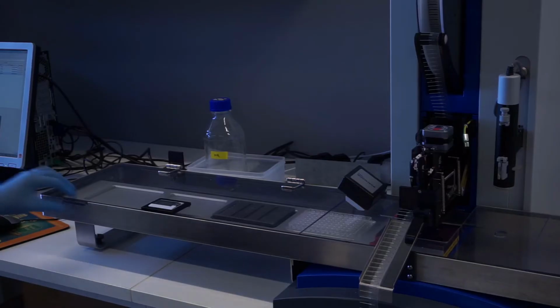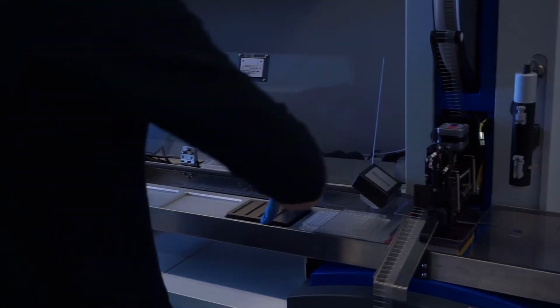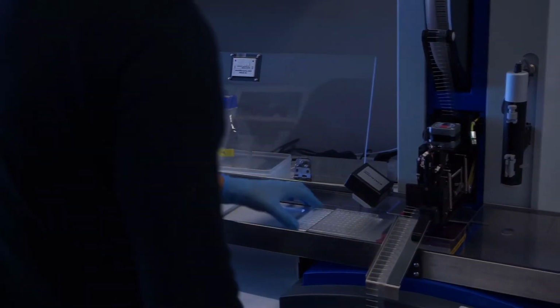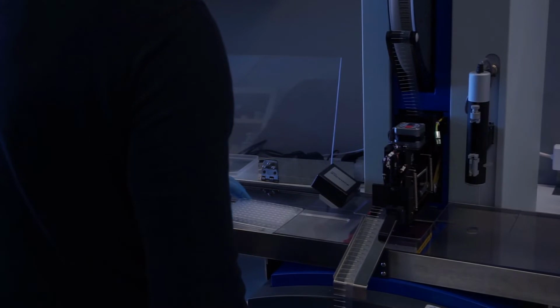When the run is finished, take the plate out and seal it with clear sealing film. Do not leave the plate standing without sealing for too long.